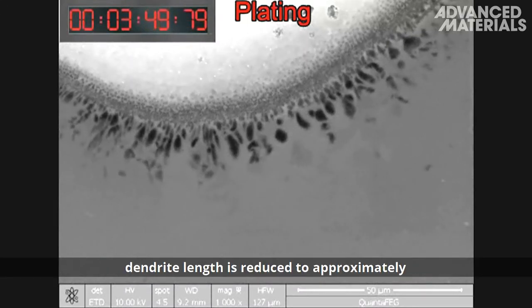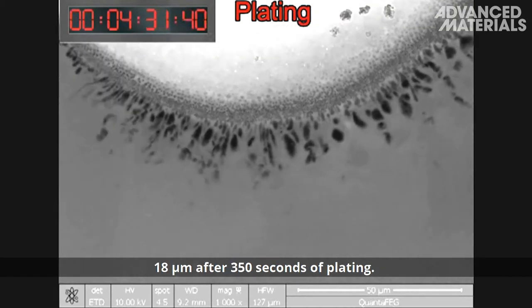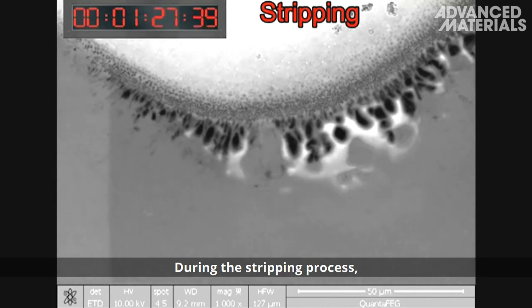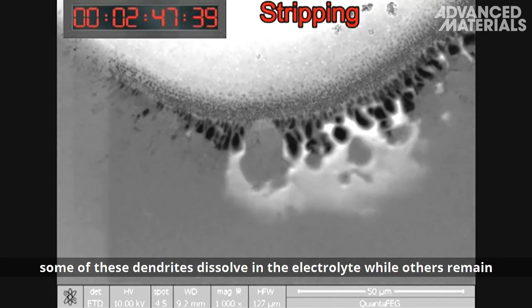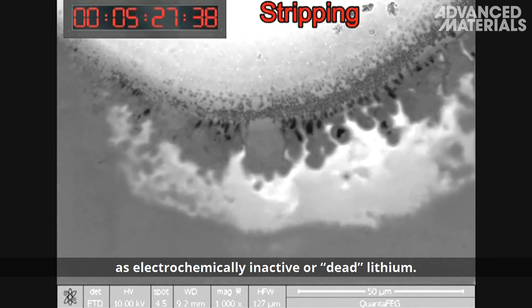When lithium nitrate is added to the ether-based electrolyte, dendrite length is reduced to approximately 18 micrometers after 350 seconds of plating. During the stripping process, some of these dendrites dissolve in the electrolyte while others remain as electrochemically inactive, or dead, lithium.